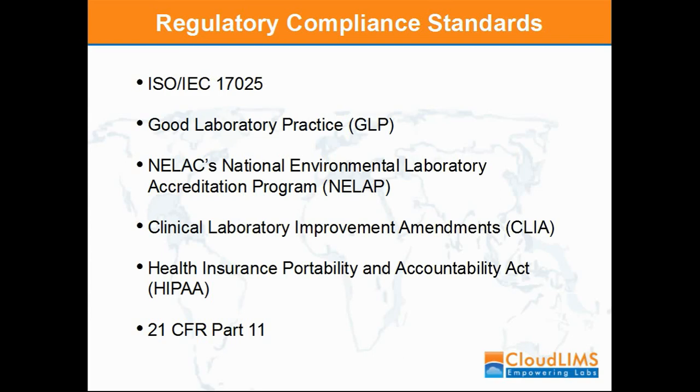A method validation document is expected to include a detailed description of the test method used, preparation of the calibration standard, potential interferences, a brief outline of the test, signature of the authorized personnel, etc. Once a method is validated, it can be used by the lab. The testing results generated using this method should be duly signed along with a date and timestamp by an approving authority. Periodical inspection of the implemented validated method is also required in order to confirm accuracy of the ongoing test.